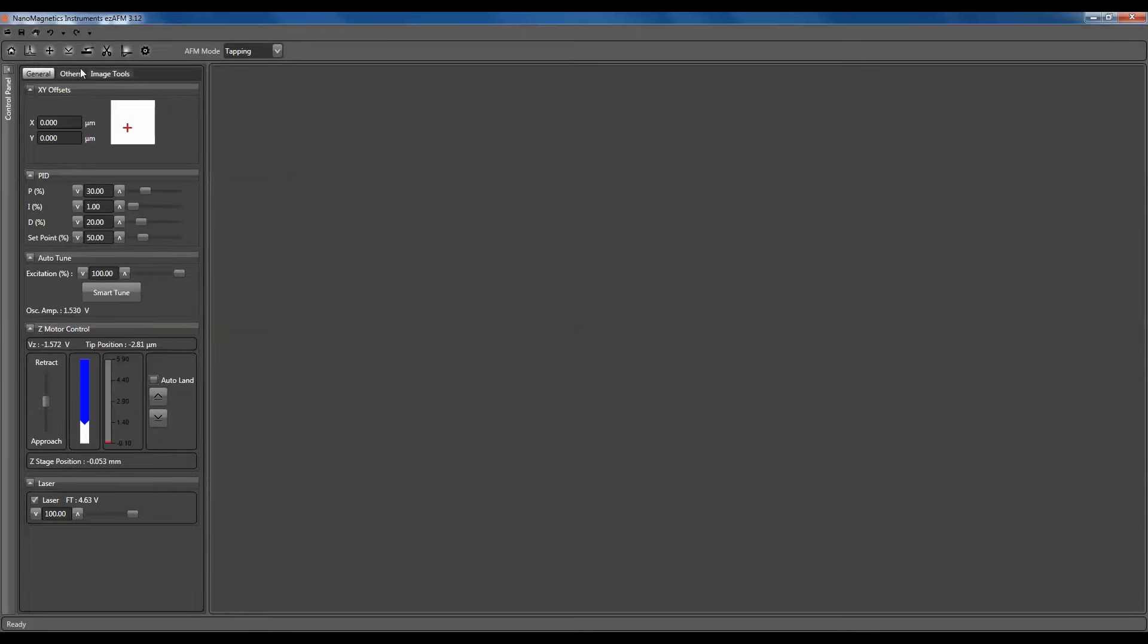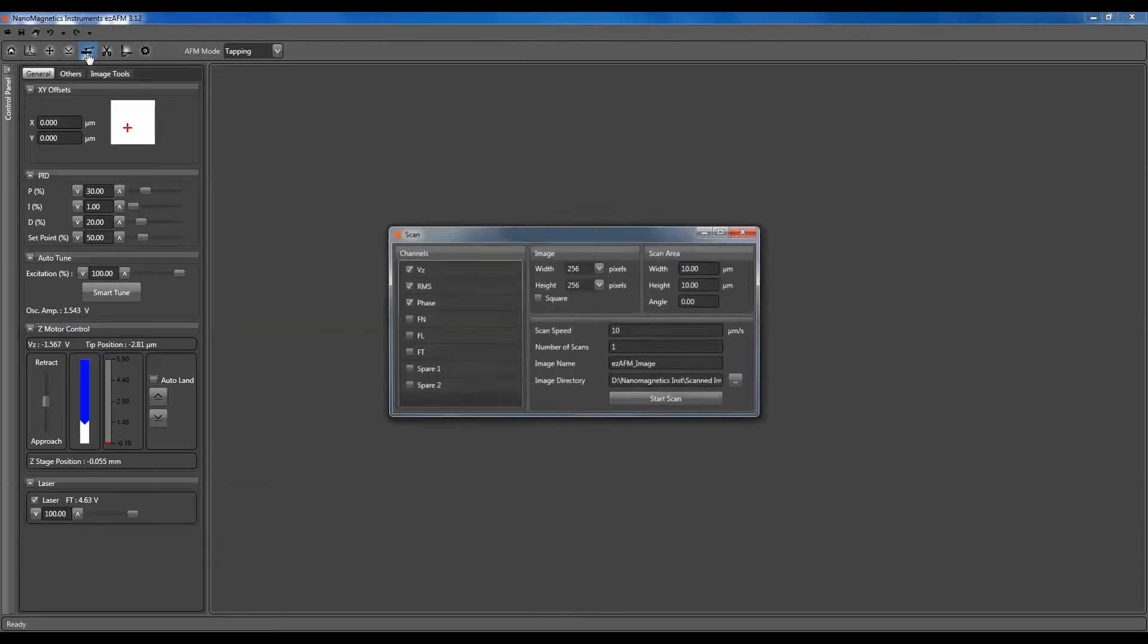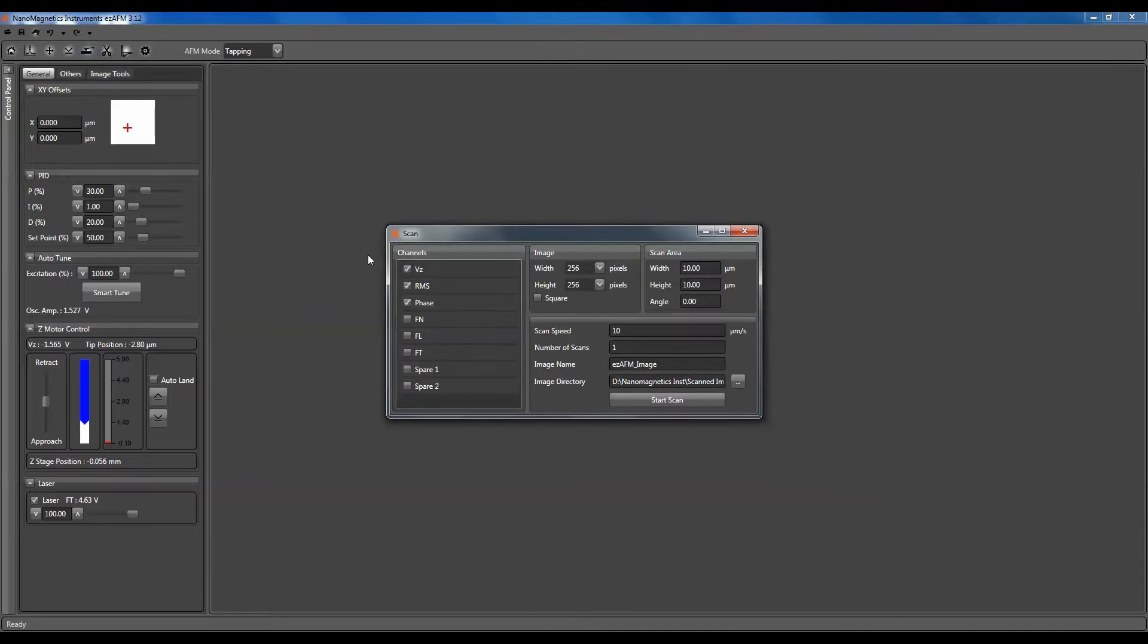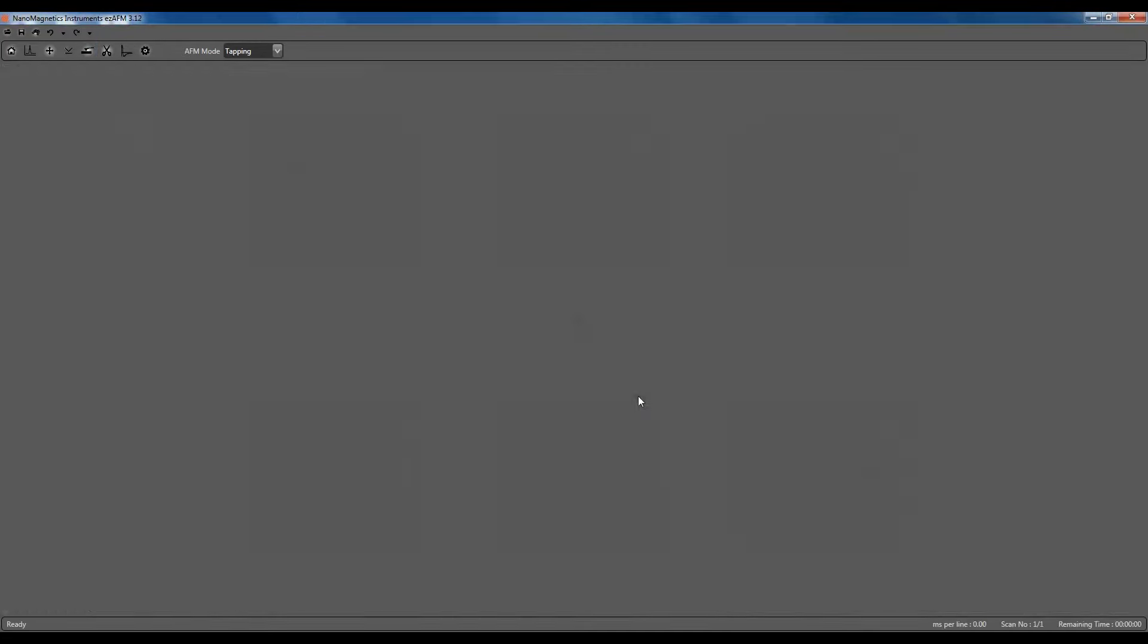Now you are ready to start your scan. Go to the Scan tab and adjust your parameters. When you're done, click the Start Scan button.